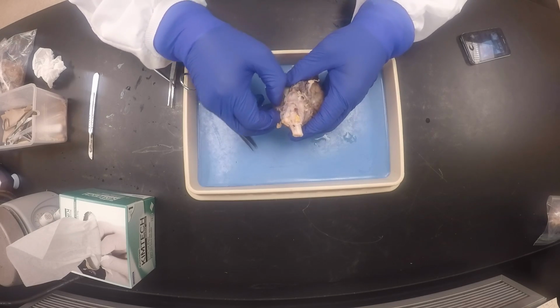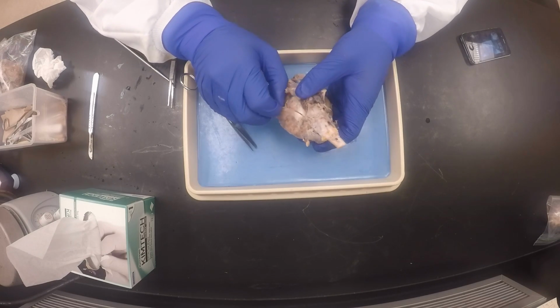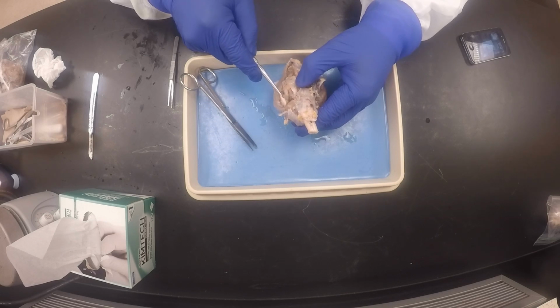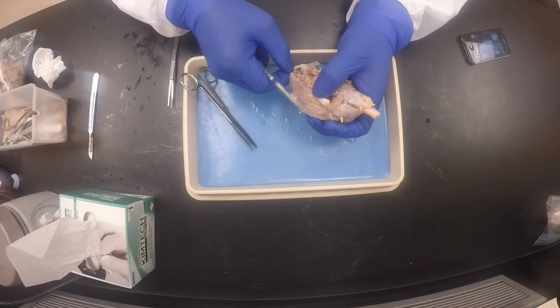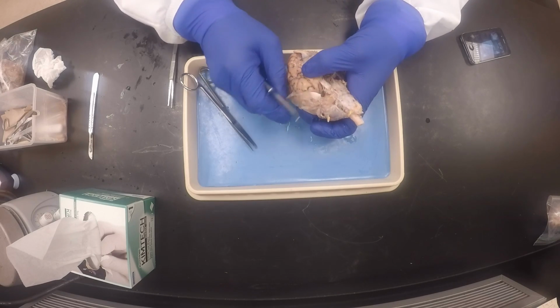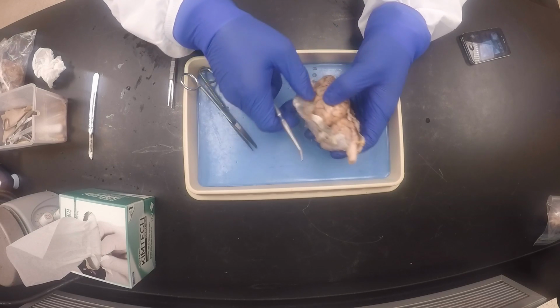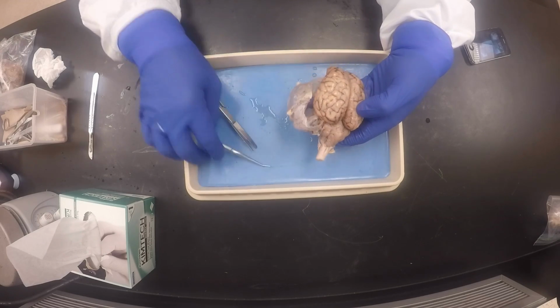So here, you want to make sure that the tentorium cerebelli has been cut. Don't want it to splash on. Then you can sort of peel it off nicely like that, and you peel it off like that. And then you make sure it's cut over here nicely.